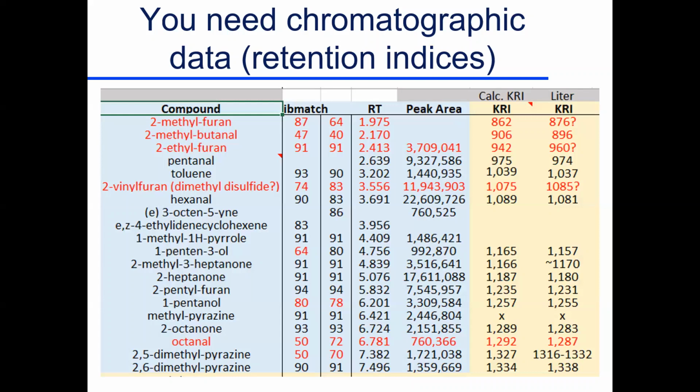So the various peaks run through this particular compound, which is 2-methylfuran, as it says over there, elutes between the 8th and 9th hydrocarbons, 62% along the way. It's basically pinning down where that elutes between hydrocarbons. That's used globally. That is the standard method of pinning down where something elutes across the globe analytically.